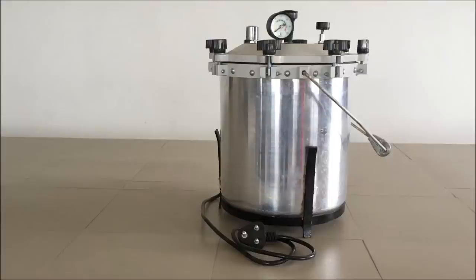Welcome you all. In this video we will discuss about the working and construction of autoclave. Autoclave is one of the important instruments used for the moist heat sterilization.